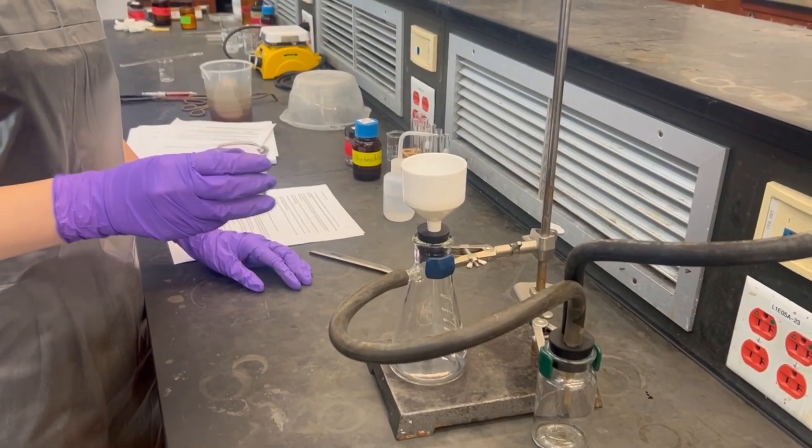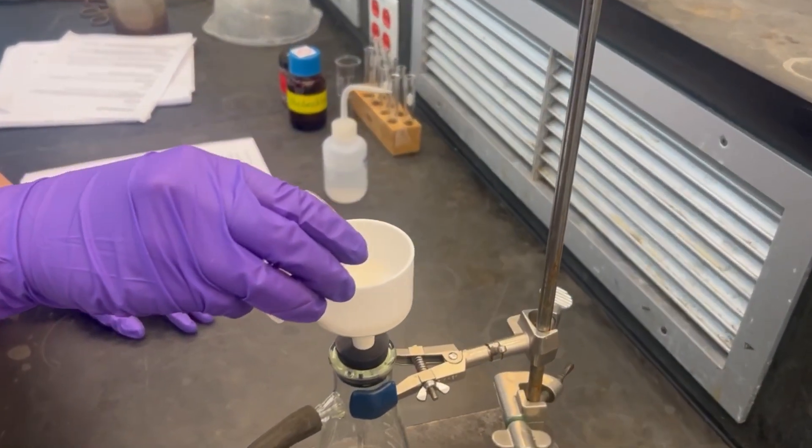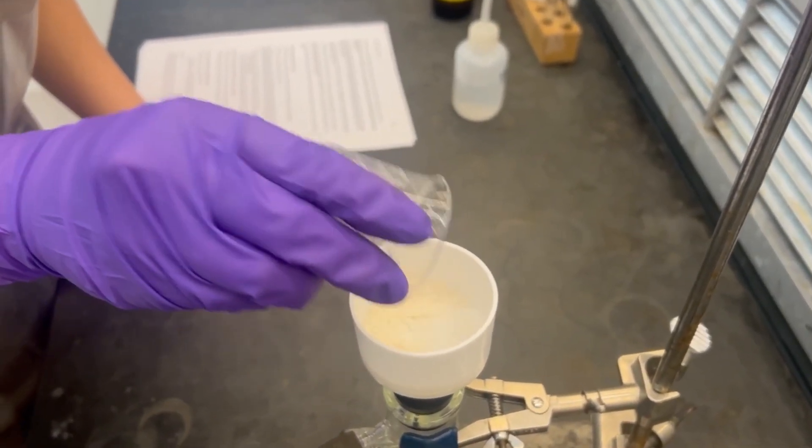Assemble a vacuum filtration setup and place the filter in. Pour the solution from the beaker into the center of the filter paper and make sure to transfer all the solids into the funnel.